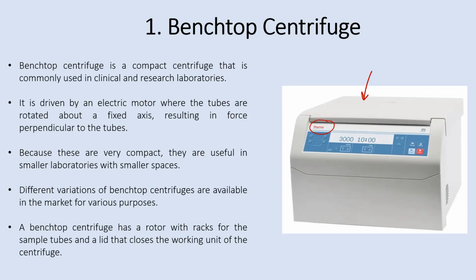Also because you do a lot of centrifugation at lower temperatures. If it is a cooling centrifuge, and your crude extract is very sensitive to temperature change, you will have to maintain a low temperature. How will you maintain it? You can set a temperature in the centrifuge. If you want to set a temperature, say 4°, then when you close the unit, that inside compartment is cooled to 4°.